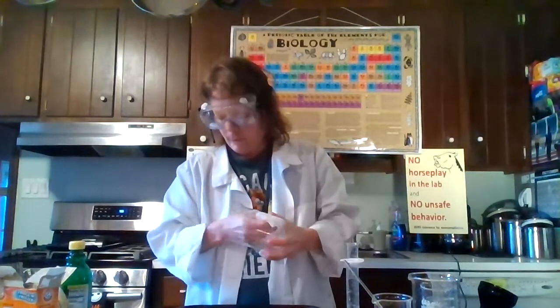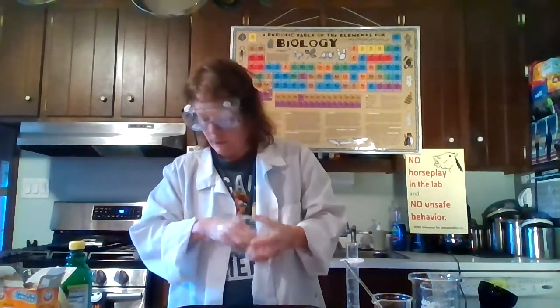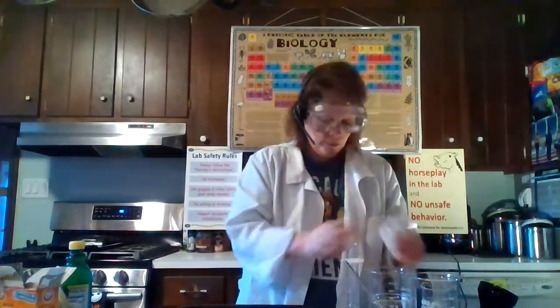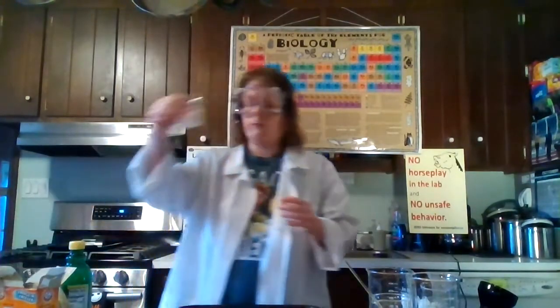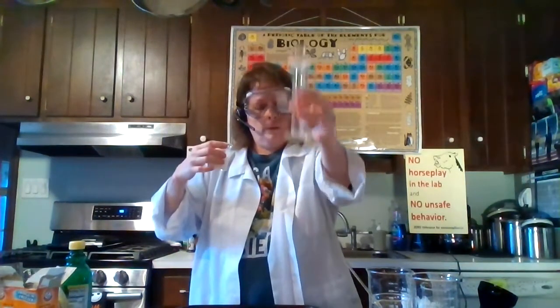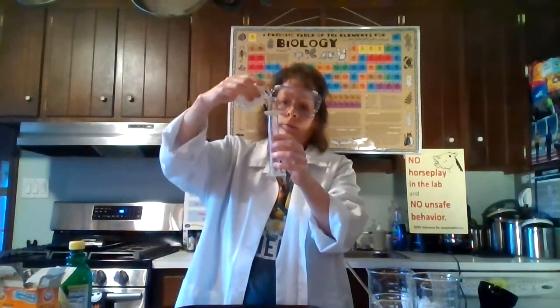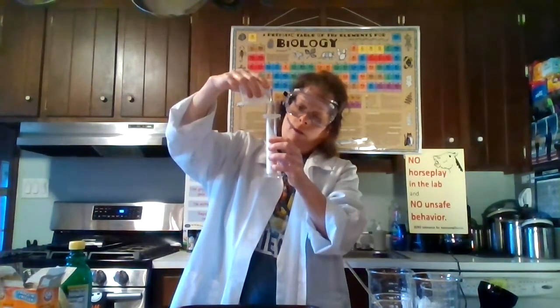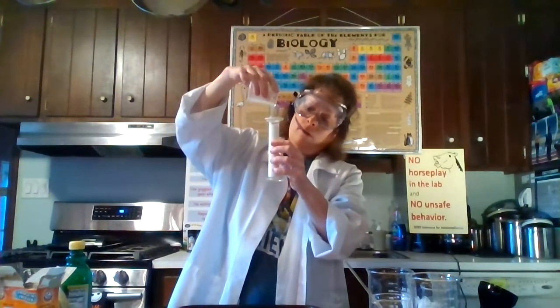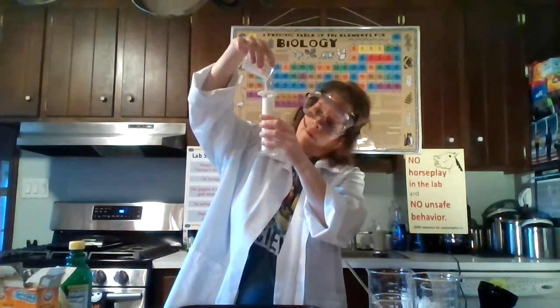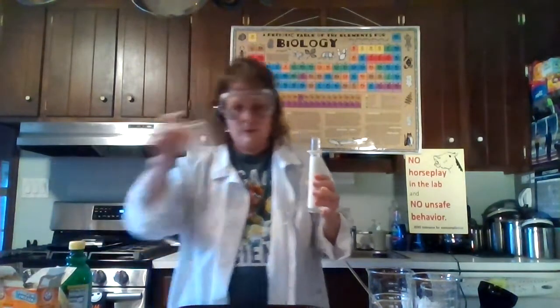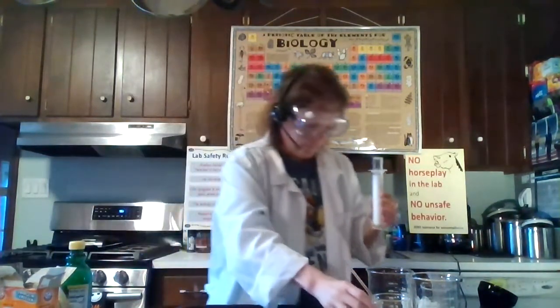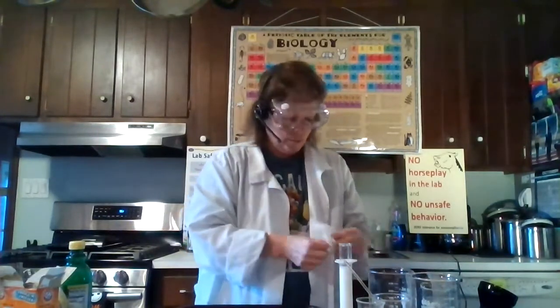We are at Experiment F: milk and vinegar. Using the graduated cylinder, measure out 50 milliliters of milk. I already put some milk in a small beaker, but let's make sure — remember, our graduated cylinder is more accurate than using the beaker. That just shows you again that the beakers are not as accurate as graduated cylinders.